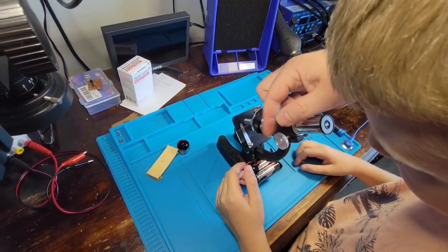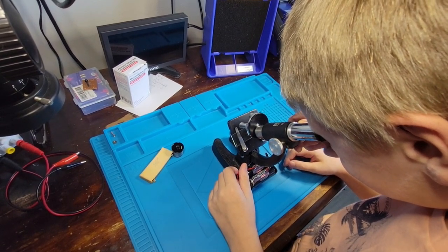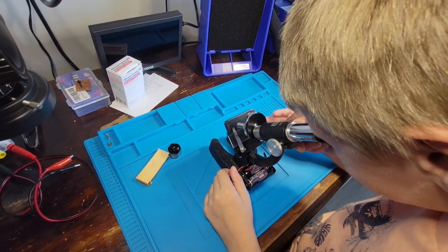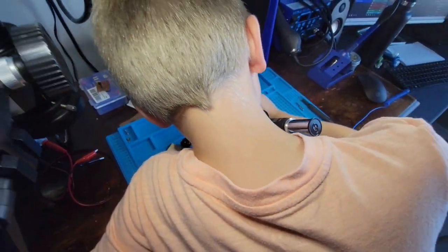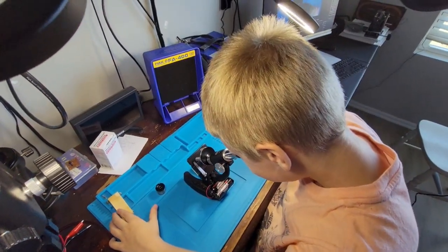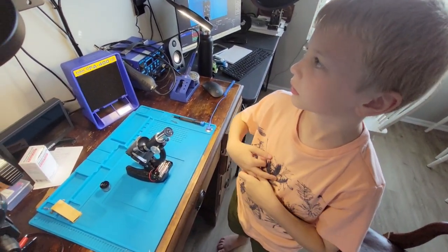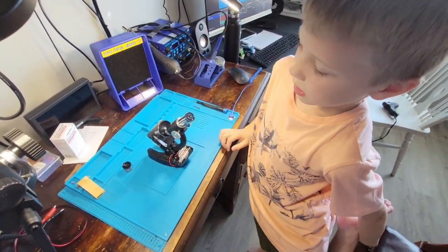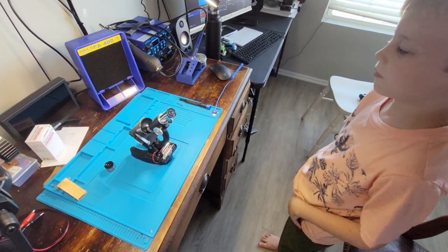Oh, wrong one. That one unscrews. You gotta use this side over here. Let me know when it's no longer blurry. Not blurry? Can you see those little fibers that are on this glass down here? Is that pretty cool? But where can we find bugs? I guess we're going to have to go find some bugs and maybe get some bug legs or some wings or something. We can look at them underneath the microscope then. Do you think that'd be fun? Is that a cool little microscope for you? You happy with it? Give everybody a thumbs up.